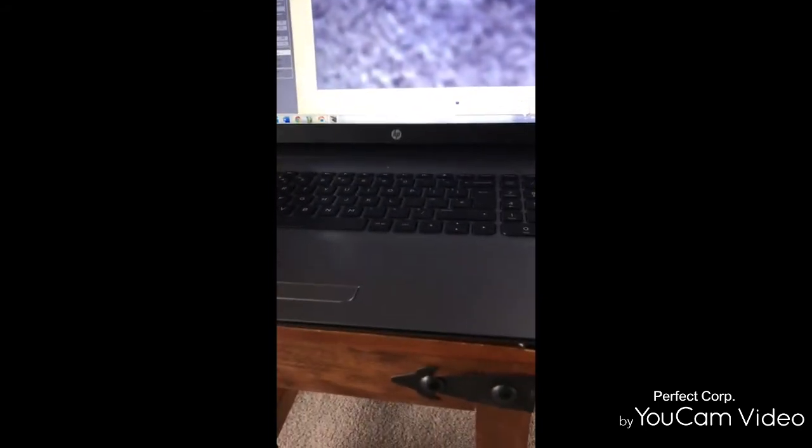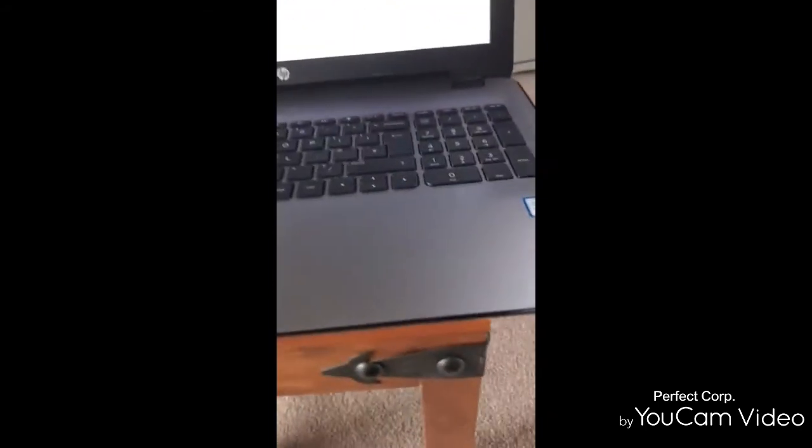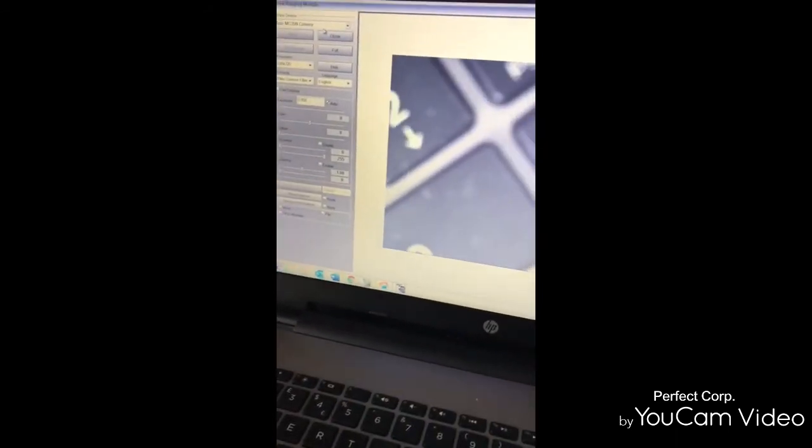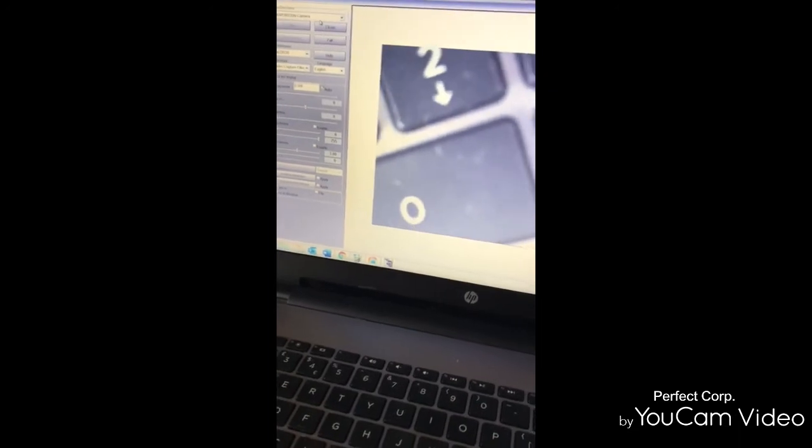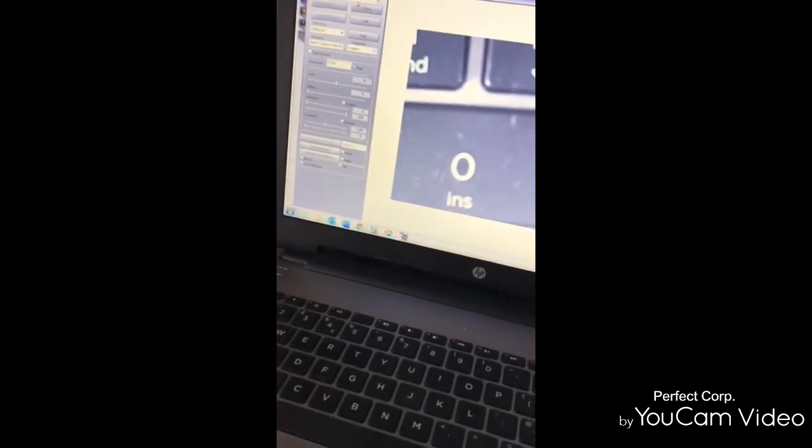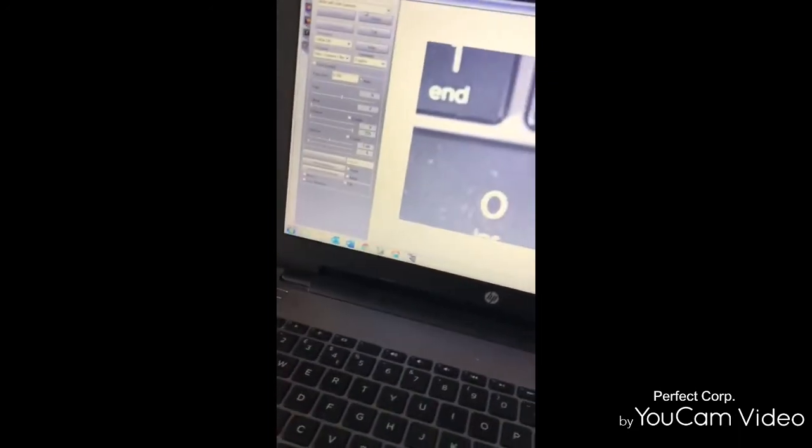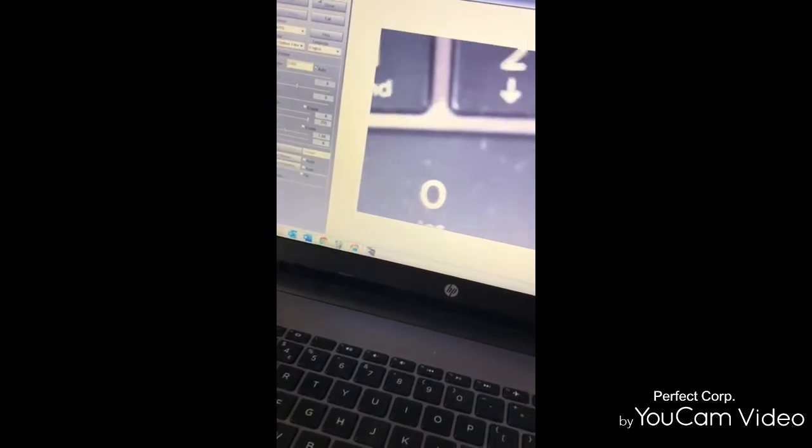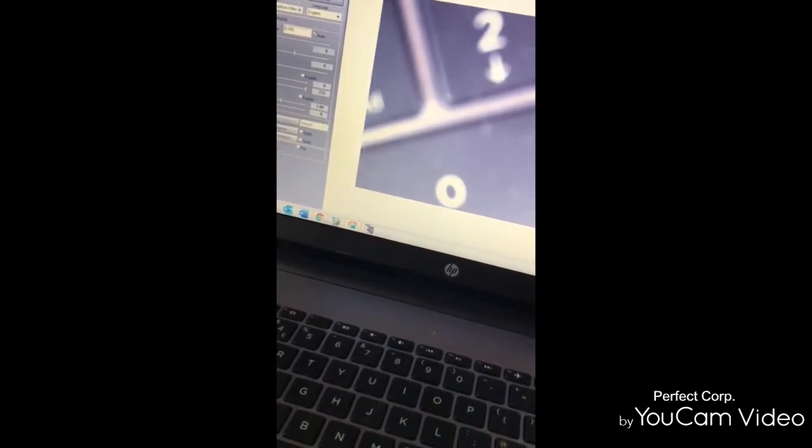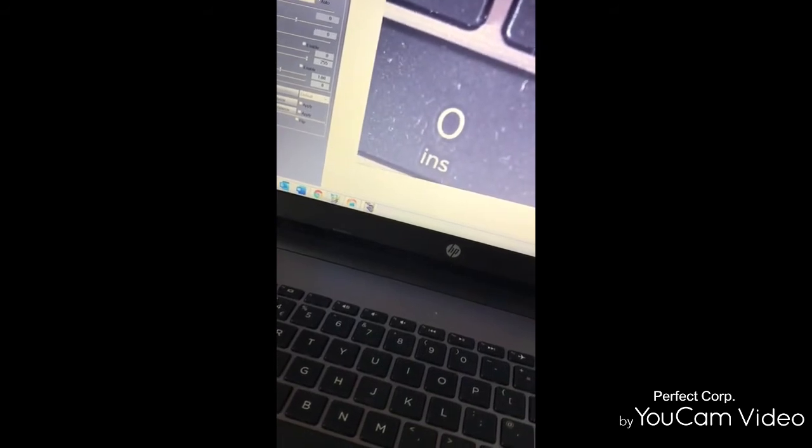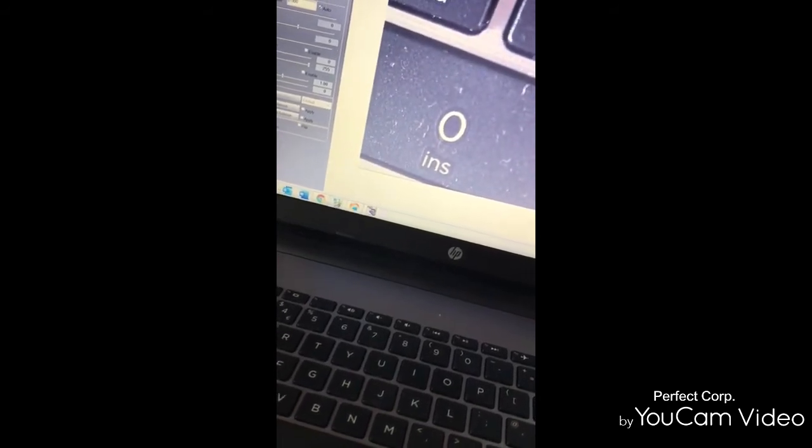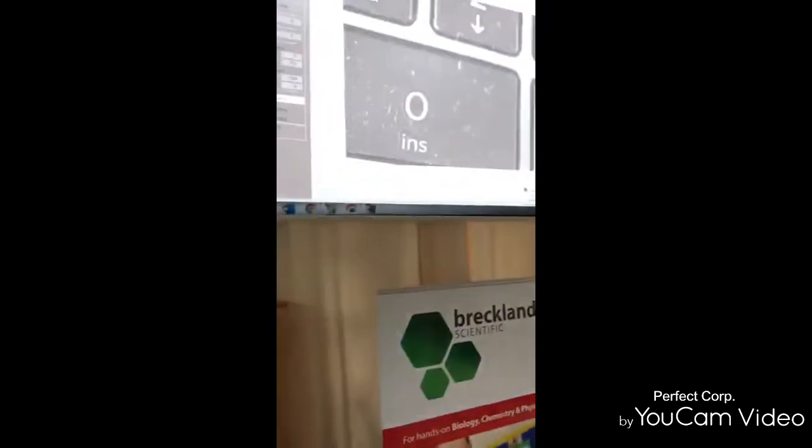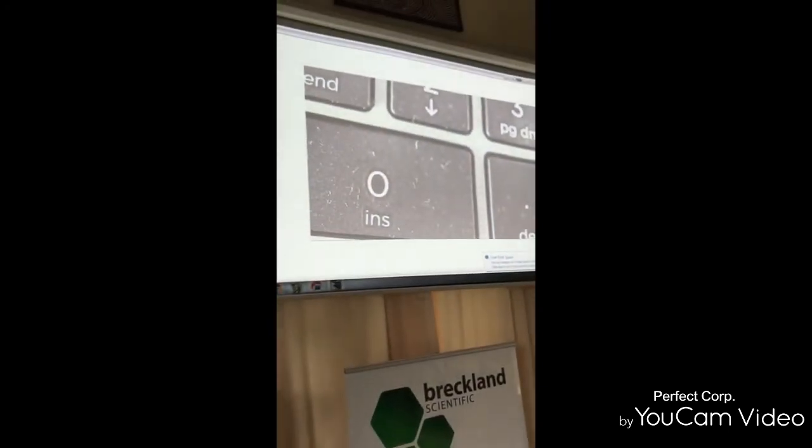So now the image has changed to my carpet. I am just going to show you that the macro viewer will auto focus or you can focus it. See the dust? And again on the screen.